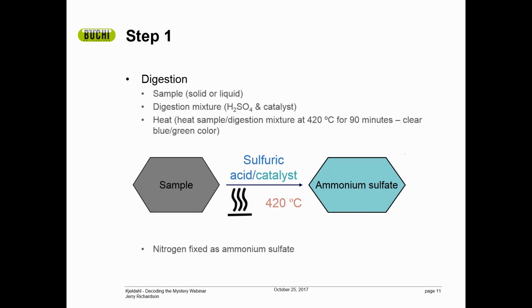All right, so when we talk about digestion, what are we actually doing? First of all, it doesn't matter whether it's a solid or a liquid. What we're going to do is liberate whatever it is from the matrix that's holding it. Most commonly, your inorganic and organic held nitrogen. The inorganic is basically a simple dissociation and goes into solution right away, but the organic does require being digested, in other words, liberated from the hydrocarbon matrix.